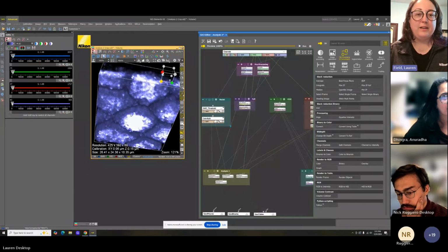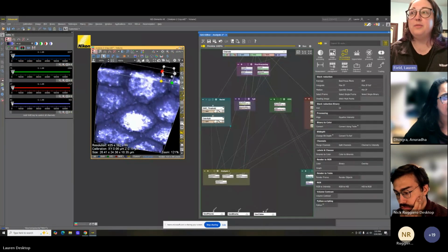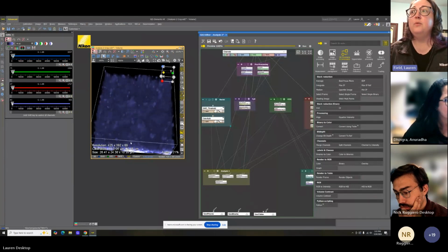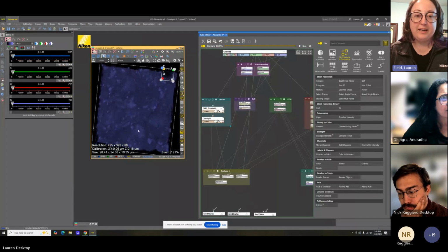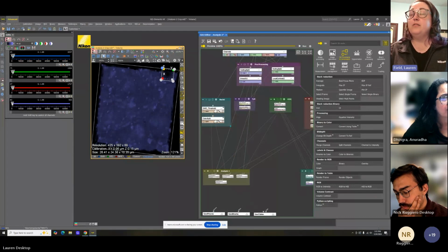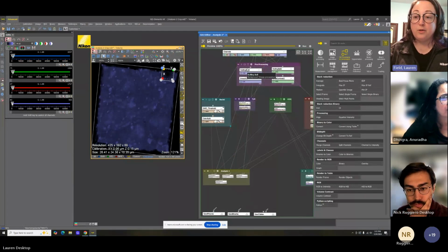You can see where there is an extracellular label that it seems like I have cell structures in here, what I would assume this is labeling as a cell. When we look at this from the top, however, it kind of looks like a lawn of fluorescent information. In pre-processing, one of my personal favorites is a rolling ball correction.